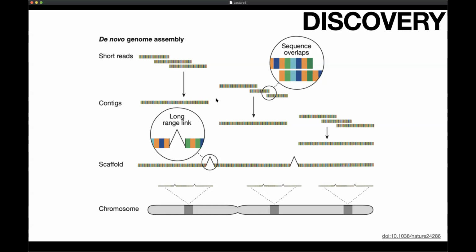Ideally, if your sequencing experiment was successful, the contig is the entire genome that you're trying to sequence. But a lot of times it will only be a partial genome. And then you have to use other techniques to connect these contigs together, paired end reads or optical mapping, again, not terribly important. And then you piece them all together into, say, if you're sequencing a large genome, chromosomal arrangements, right?